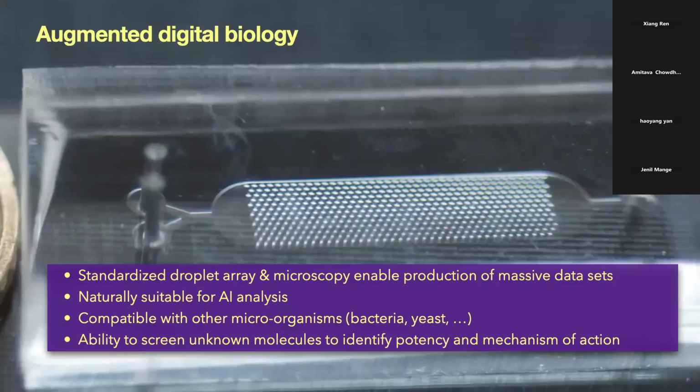And so this is very much engineering work. We've standardized the microfluidics, we've standardized the analysis, and now we can run many different molecules and try to understand what they are doing. And we're also applying very similar analysis to yeast cells and to different types of microorganisms. And so we think that this is a platform on which we can build for doing really new types of biology.